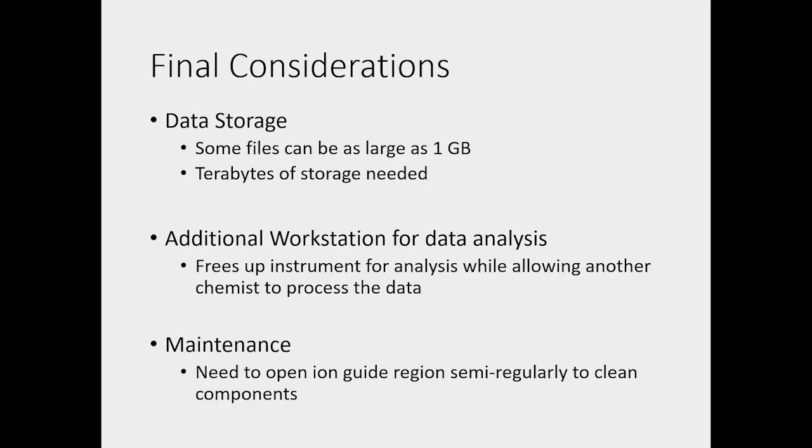Final considerations: the raw data from the DART is very large data files. So we actually had to have more data storage than we would have to just to back up a GCMS. We have these external hard drives that store a few terabytes, and that can get expensive.